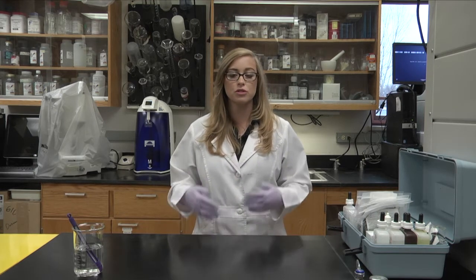Anytime you're working with chemicals, it is important to take safety precautions such as wearing a lab coat, long pants, closed-toed shoes, gloves, and safety glasses or eyeglasses.